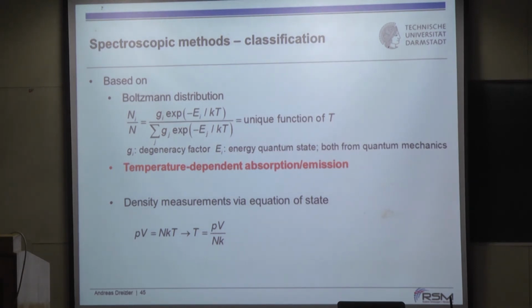You can do that, but you have to test it out. You have to check it. Then you take your, I don't know, calibration flame where you know that you don't have any heat losses. Take a flat flame, for example, and be sure that it's adiabatic or as adiabatic as possible. Yeah, and then you repeat your measurements 1,000 times. You take the standard deviation. You'll see your precision, yeah, in the single shots. But I think you will lose precision. All right. Then let's continue.